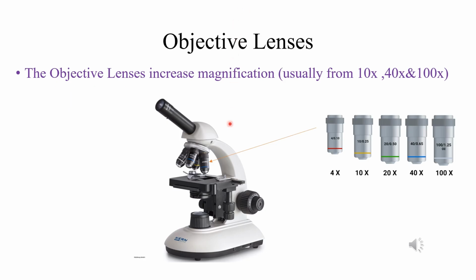Objective lens. The objective lens increases the magnification of the image. In a microscope, two types of lenses are used. The first one is the objective lens, and this is the ocular lens or eyepiece. So when the light rays pass through the specimen, they enter into the objective lens. So the objective lens will magnify the image.